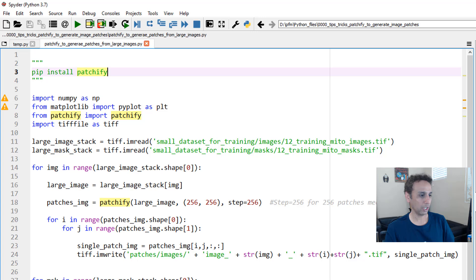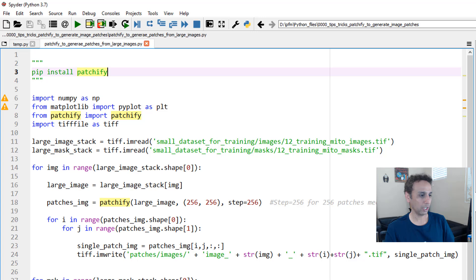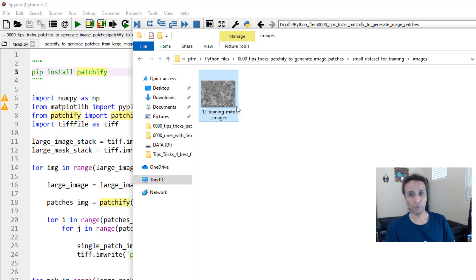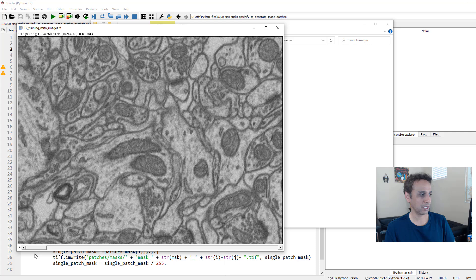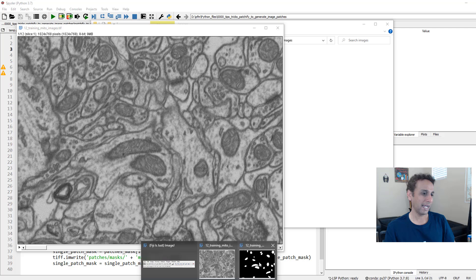Here is the code. What you need to do is pip install patchify—P-A-T-C-H-I-F-Y—and it works great. What I have here are a couple of images. Let me open to show what we have here. This is an image stack, a TIF stack, that has 12 images here. Of course, in real life you may have hundreds of these images that you have annotated. Here is the corresponding mask.